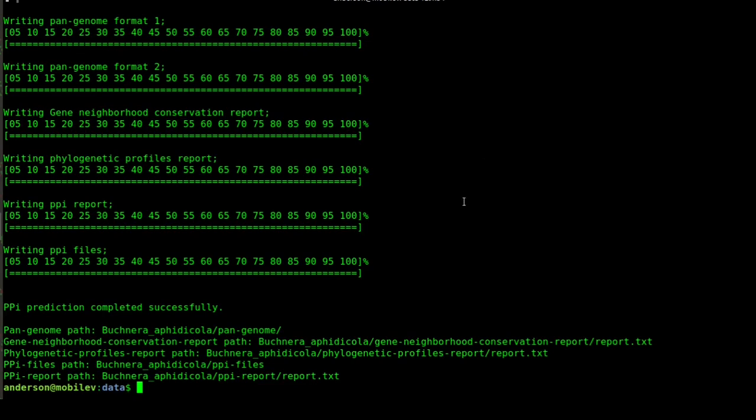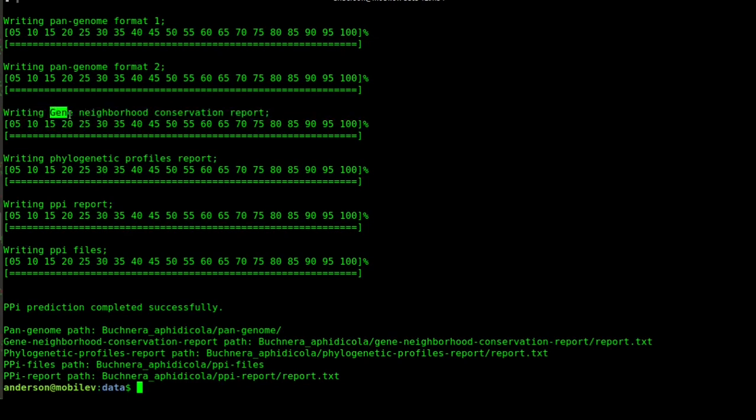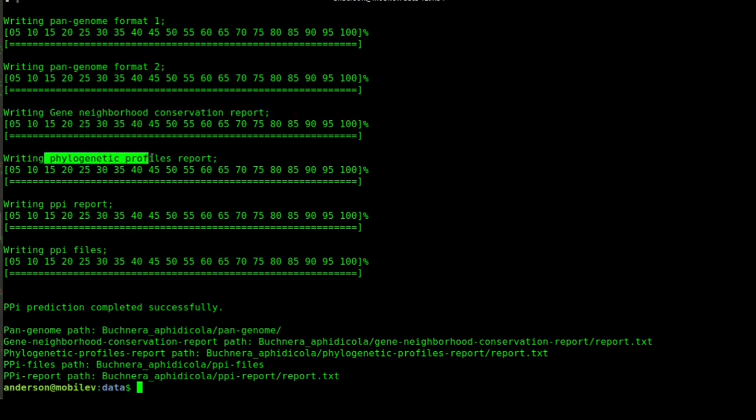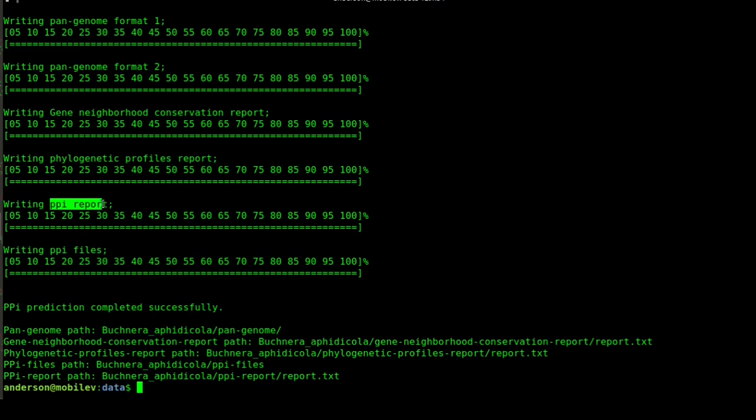After that, we analyzed the five genomes according to the Gene Neighborhood Conservation and the Phylogenetic Profiles report. The final step was the PPI report generation for each genome. In the result folder, we have a few reports. For example, we have the Gene Neighborhood Conservation report, the Phylogenetic Profiles report, the PPI files, and the PPI report. Let's see it.